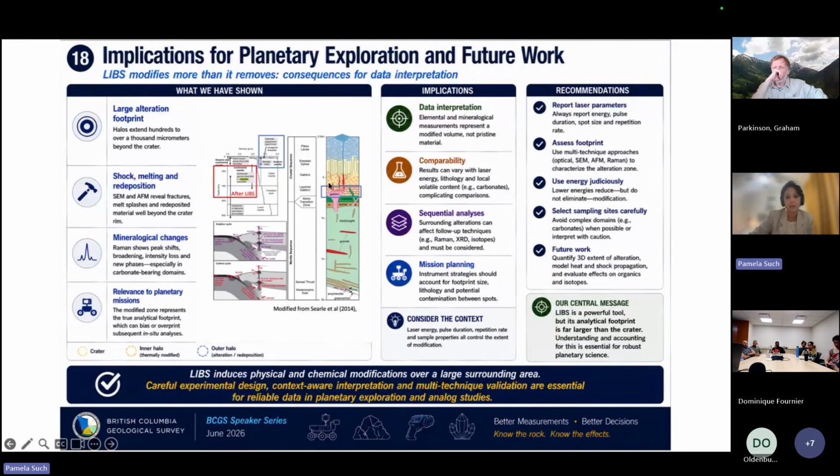For example, in our case, our samples belong to an ophiolitic sequence that was a basic sequence. And after LIBS, we have continental, very deep continent samples. So we basically changed the tectonic history of this sample when we shoot LIBS and then perform the studies. This experiment that we performed in the lab was very important to understand the order. Sometimes we have to think about the way we are analyzing our samples, and why we're doing it.